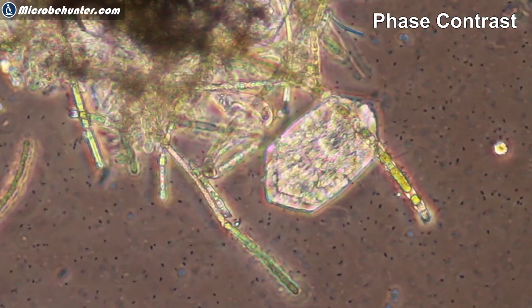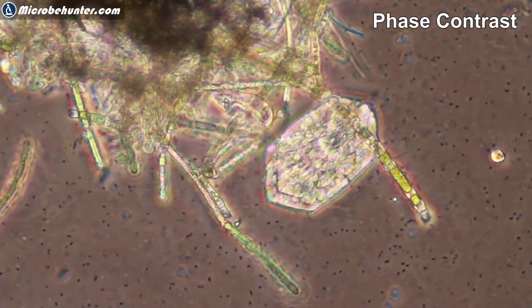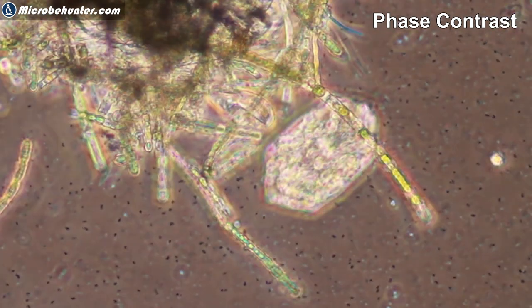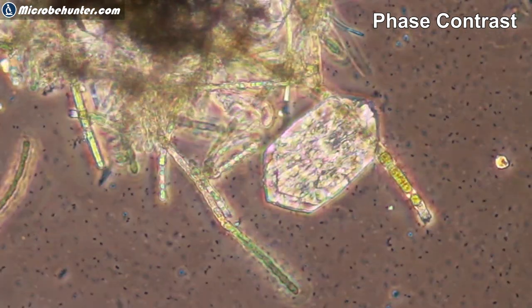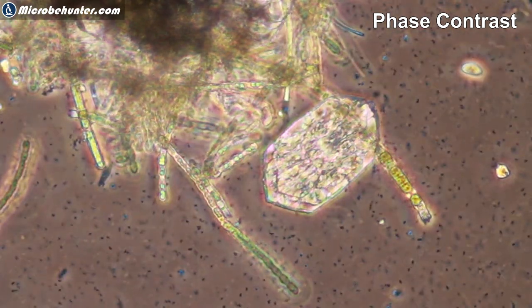This one here is now a little bit bigger, but not because I changed the objective, but I cropped in a little bit. And now the bacteria are much better visible as dark dots moving around. Now a little bit of theory. I'm going to explain you now what phase contrast is.